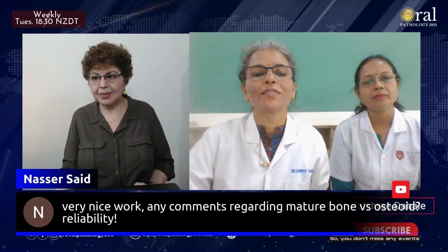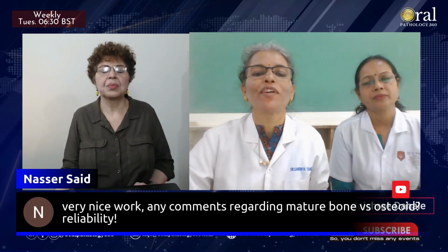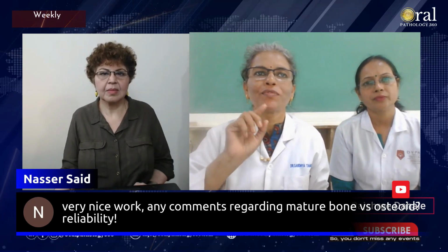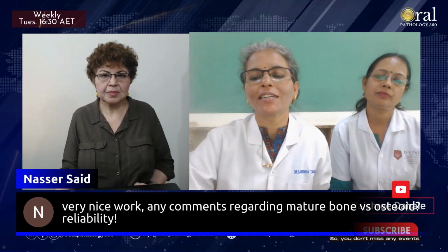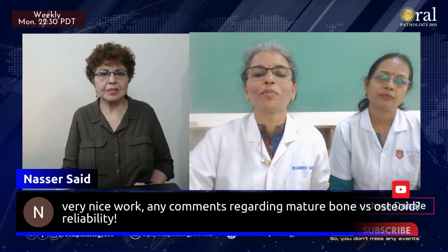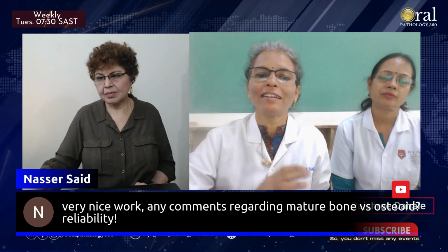Yes, madam. We can use it in both types of bone, mature bone as well as osteoid. In fibro-osseous lesions, one hypothesis we mentioned in that article also states the grade of calcification, because mature bone will be a little more highly calcified and osteoid a little less.